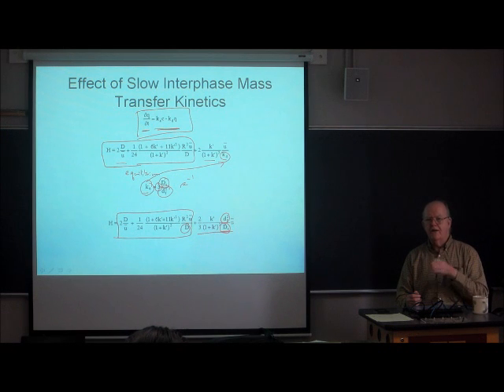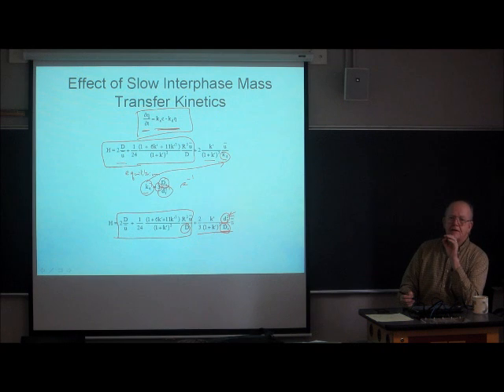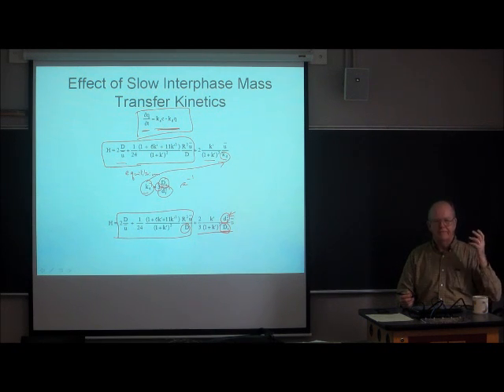Now the only way that's not going to kill us, I mean really beat us over the head, is if the film is very, very thin. So micron dimension films, even if the capillary is half of a millimeter ID, you would still only use a micron film probably at the thickest.